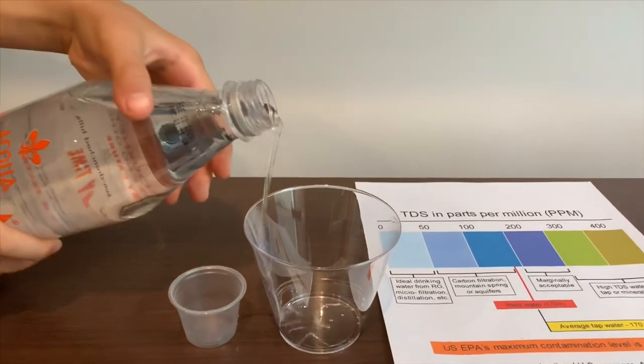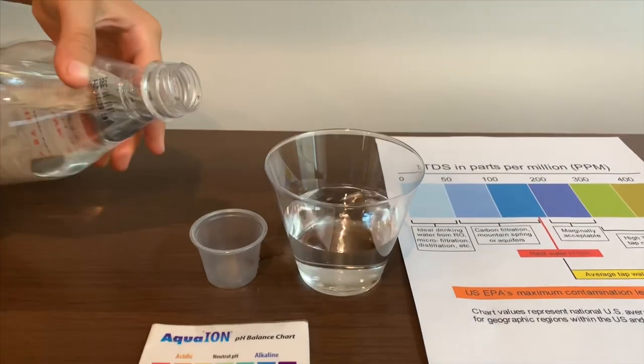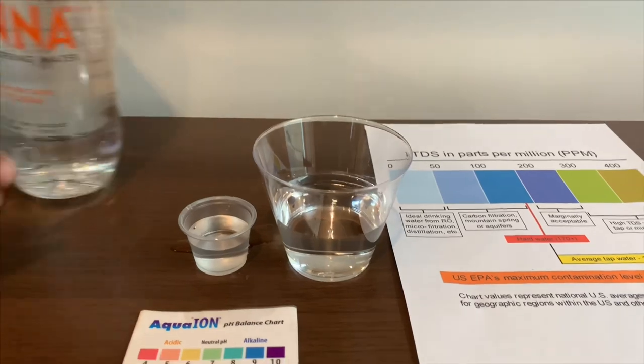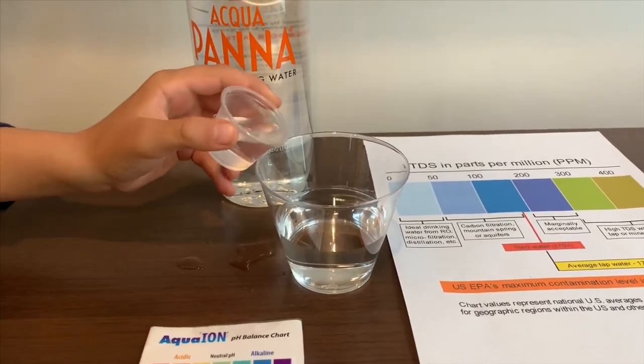Let's pour some water in. This is a little too much for the pH test. Let's put some back in the TDS.